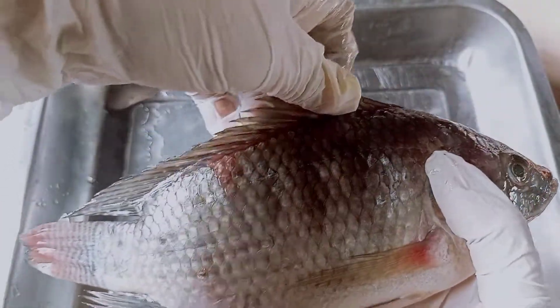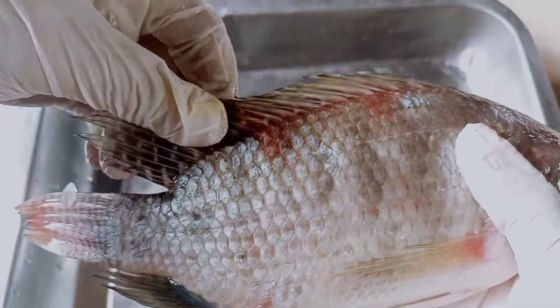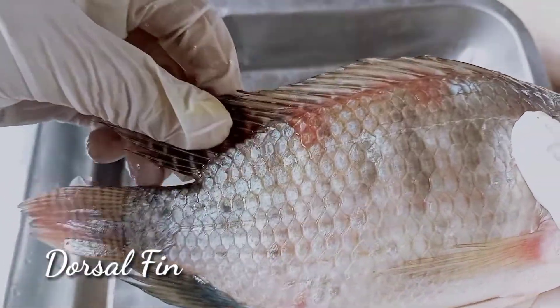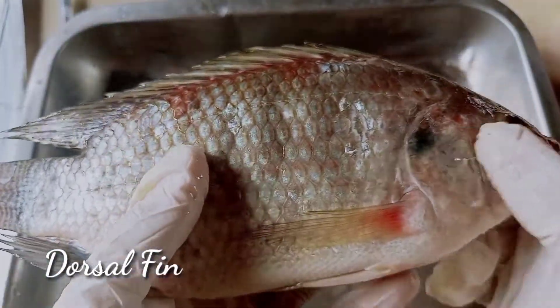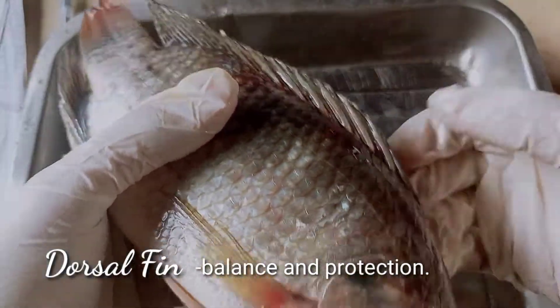Up on top here, we can see these spines — their fins, what we call the dorsal fin. The dorsal fin helps them balance in the water and also serves as protection.